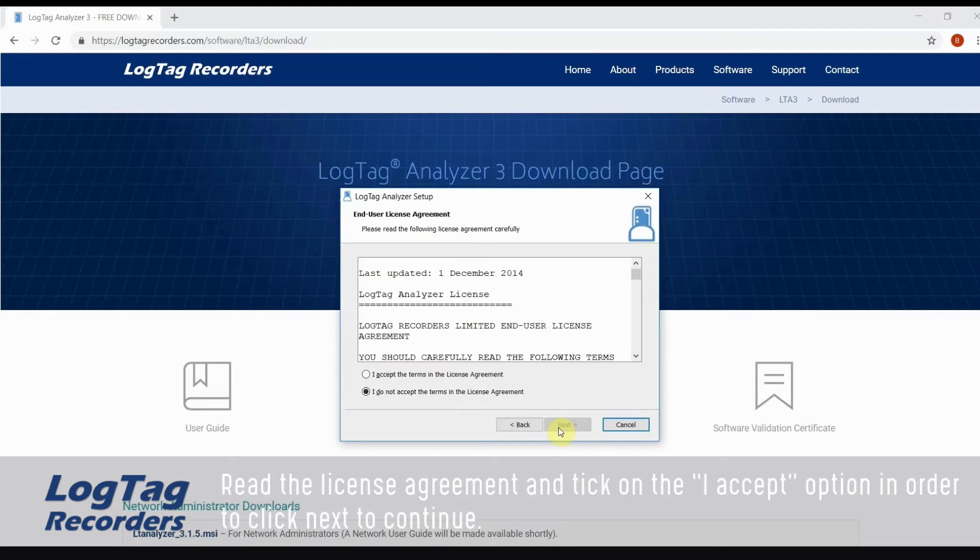Read the license agreement and tick on the I accept option in order to click next to continue.